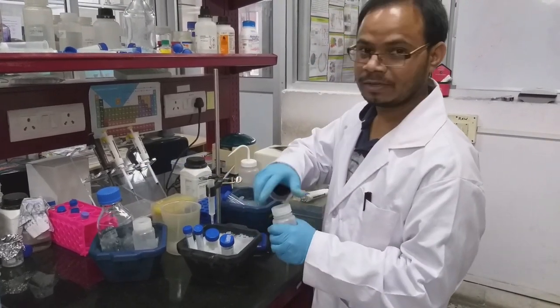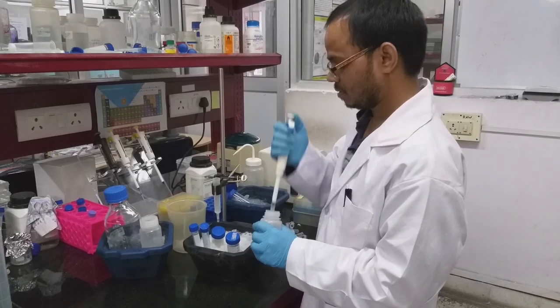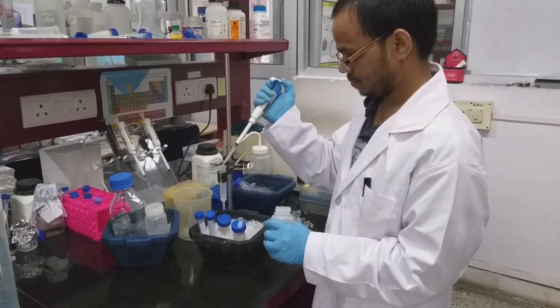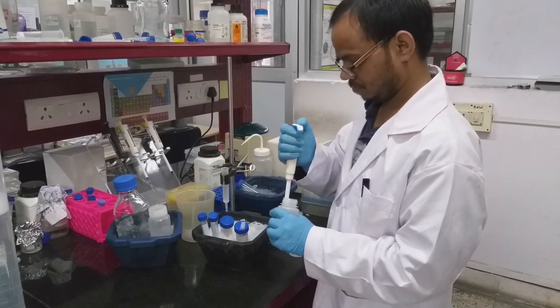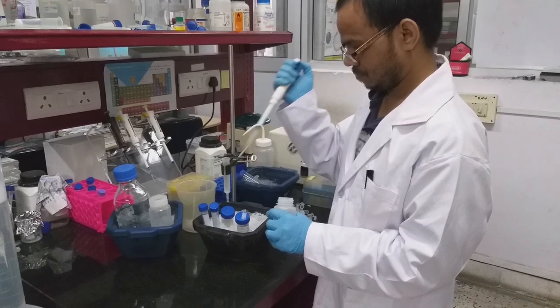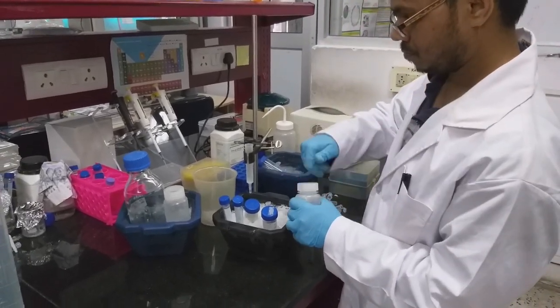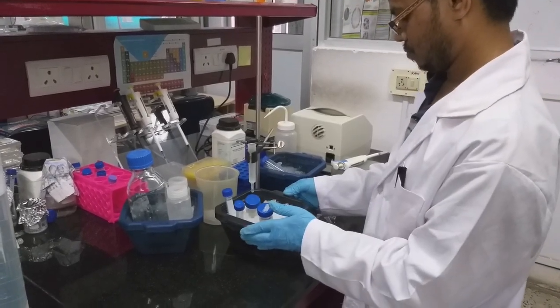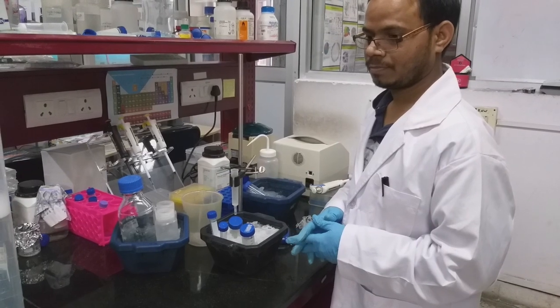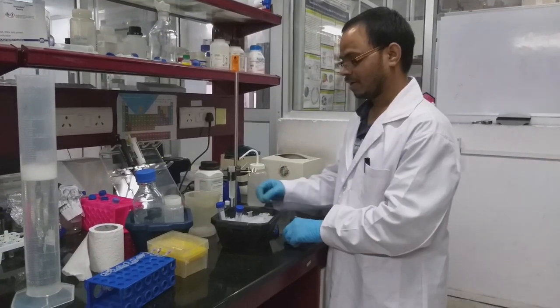In the final step, we are going to elute with the 250 millimolar imidazole containing buffer. So what we are going to do is incubate the beads with this buffer for some time and collect the fractions. Now we have to collect the fractions.